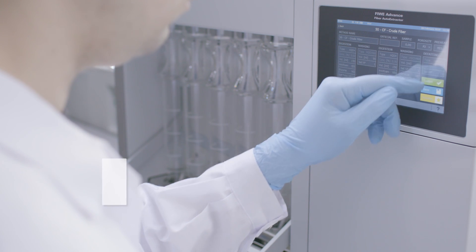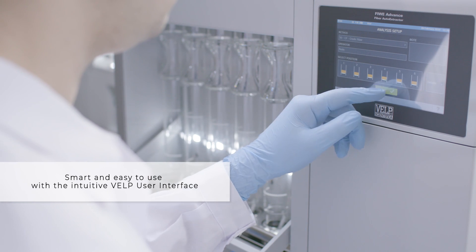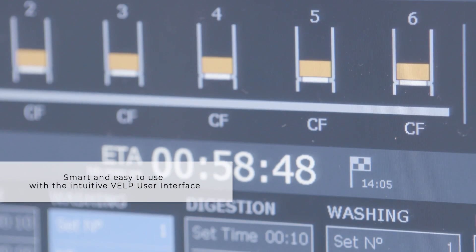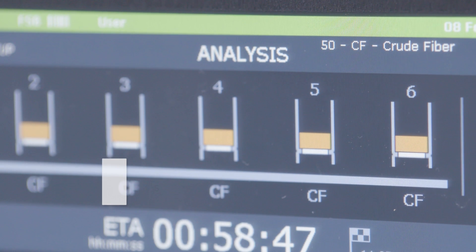A bright seven-inch touchscreen and the intuitive VELP user interface make it fast and easy to program and manage your analysis with one-click start.